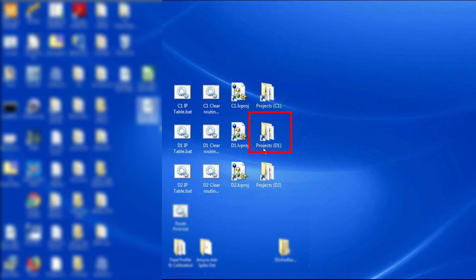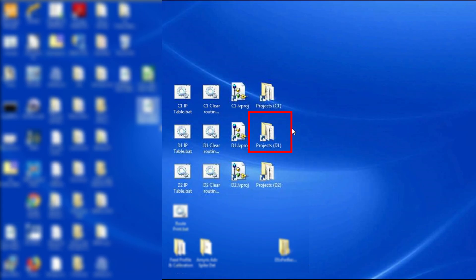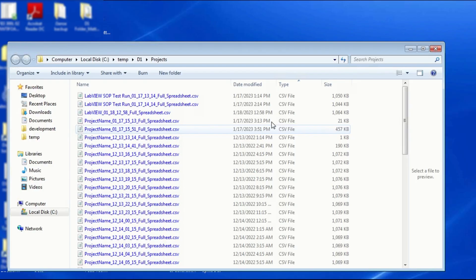It is also good practice to check if your files are being saved. This is also how you can access your files. To look for your project files, in the desktop screen, double-click on the Projects folder and look for your own project name.